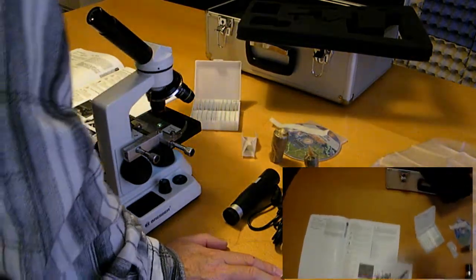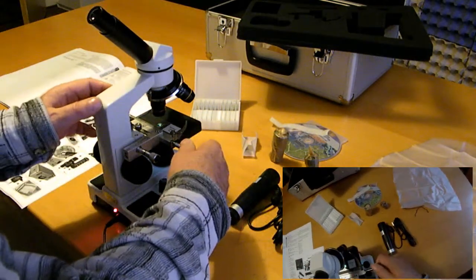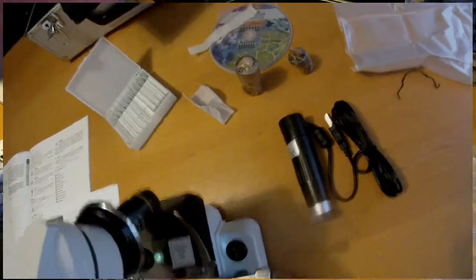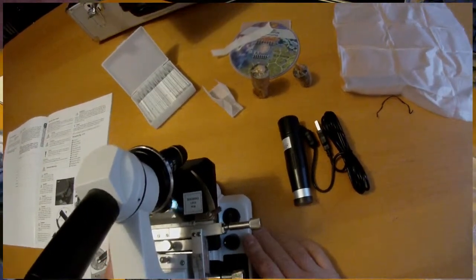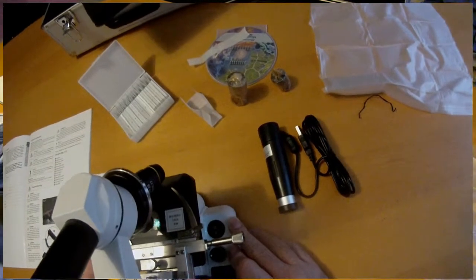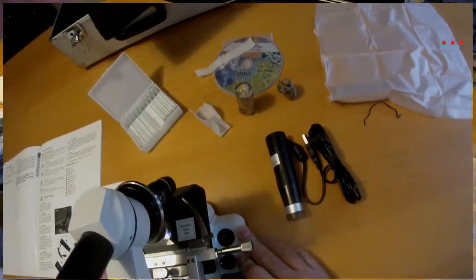The slide stage, number 13. Where is the slide? This mechanism is called the slide stage. You see here, let me turn it up and make the filter white, so without any filter. See there, it's nice. Over there, different colors. Different shapes as well, I think. Then back, completely without any filter. Wow, a lot of colors.